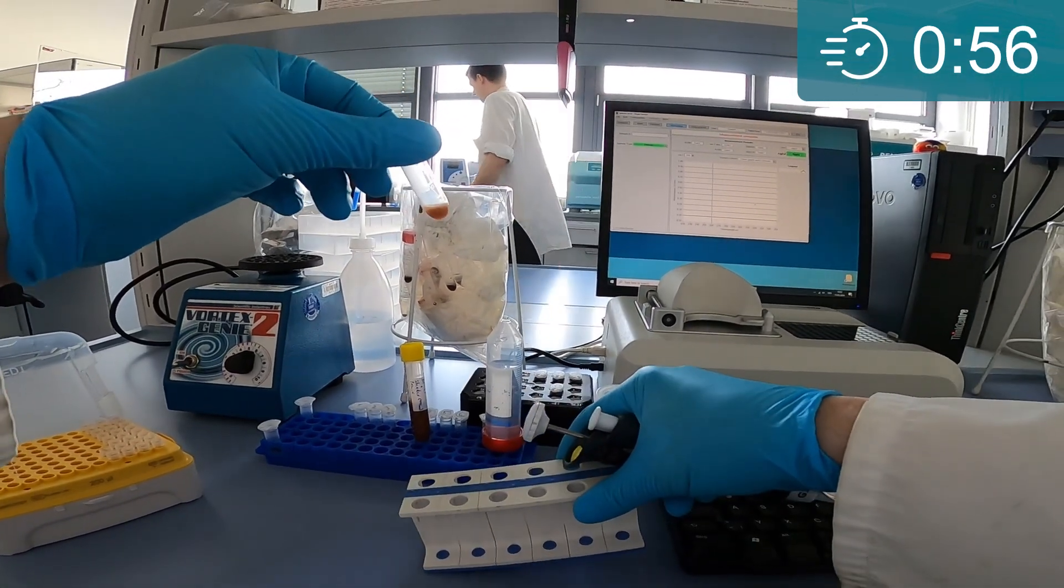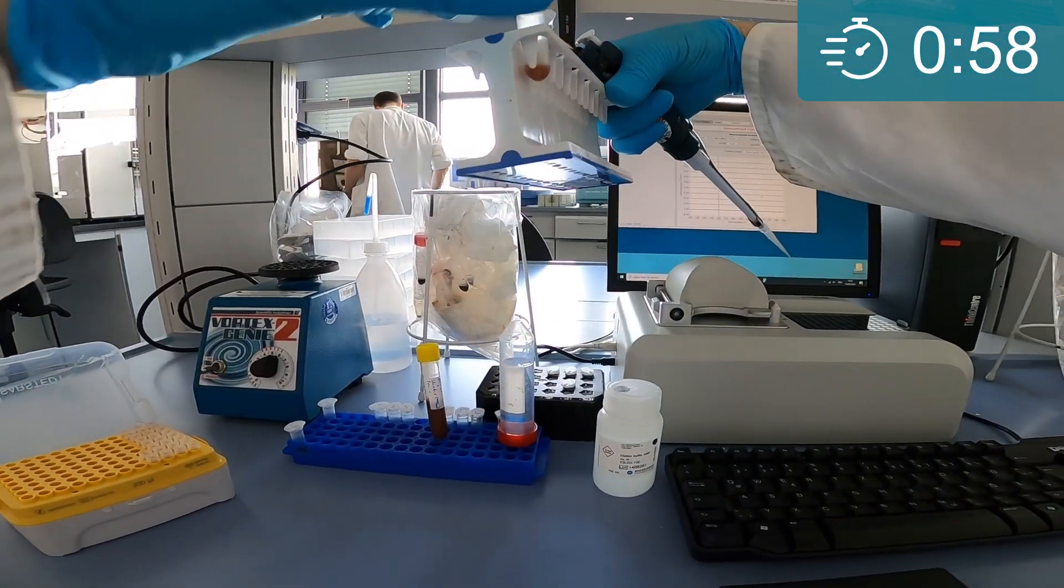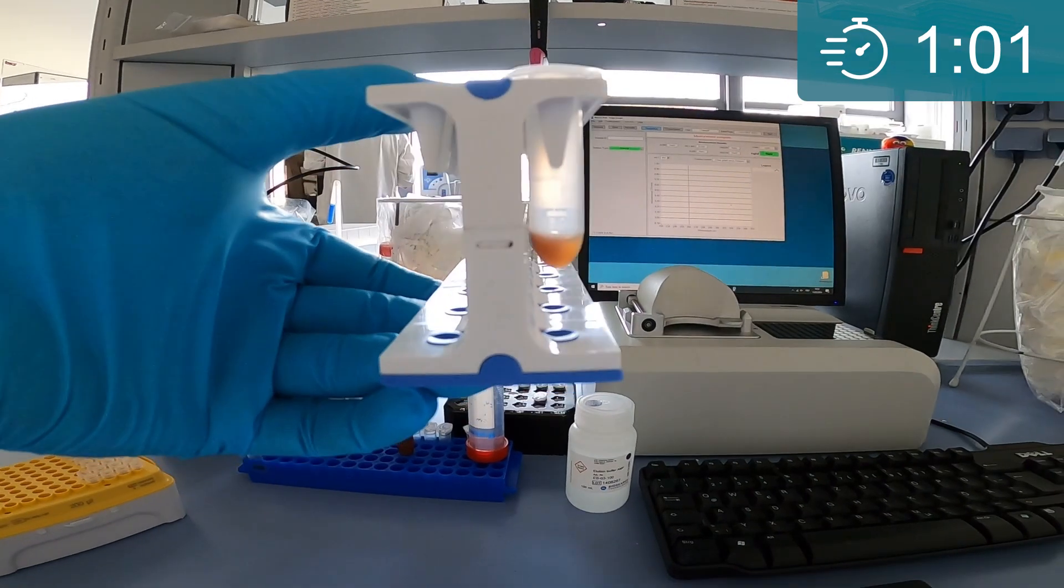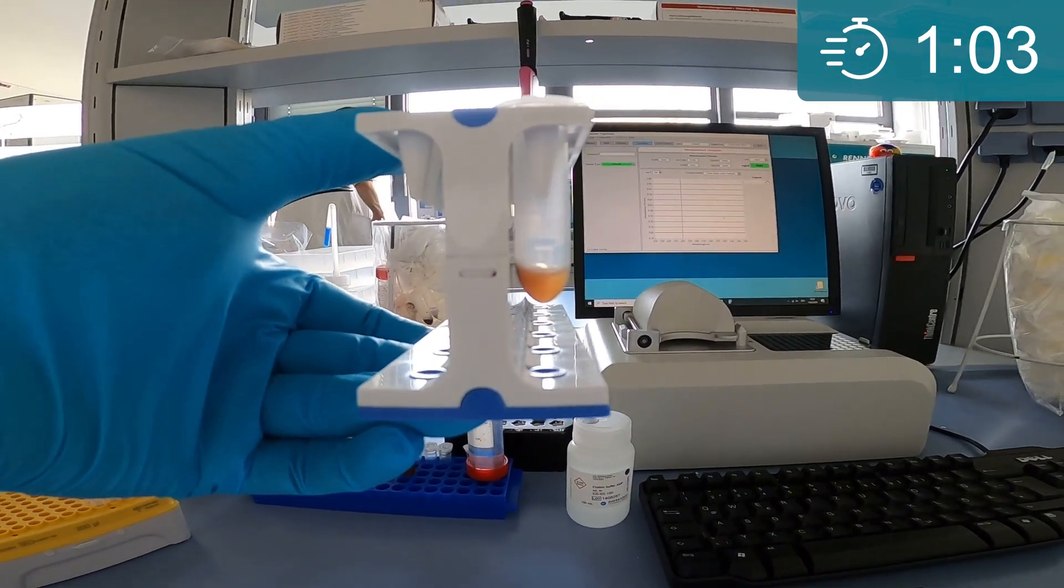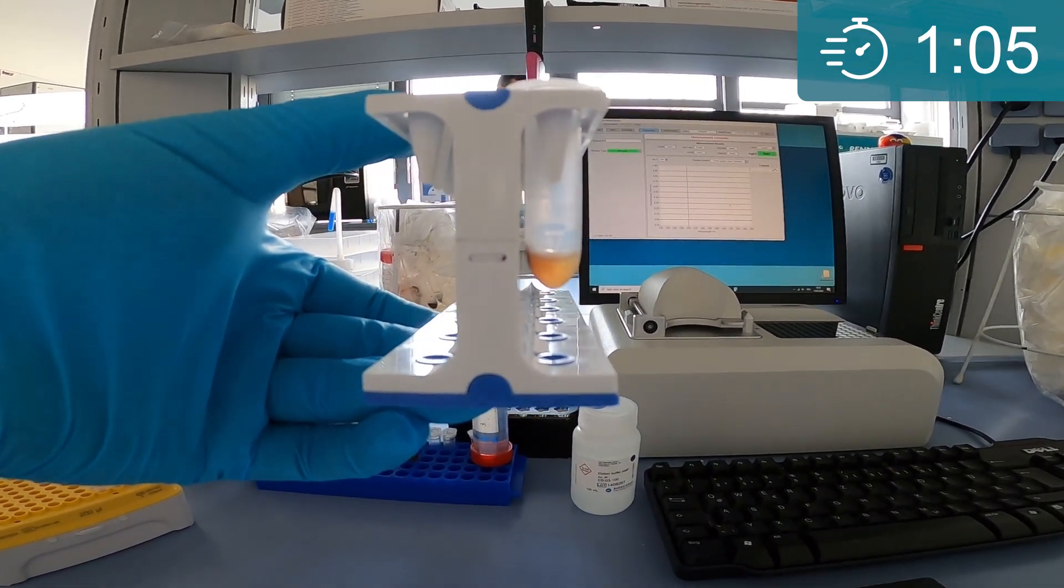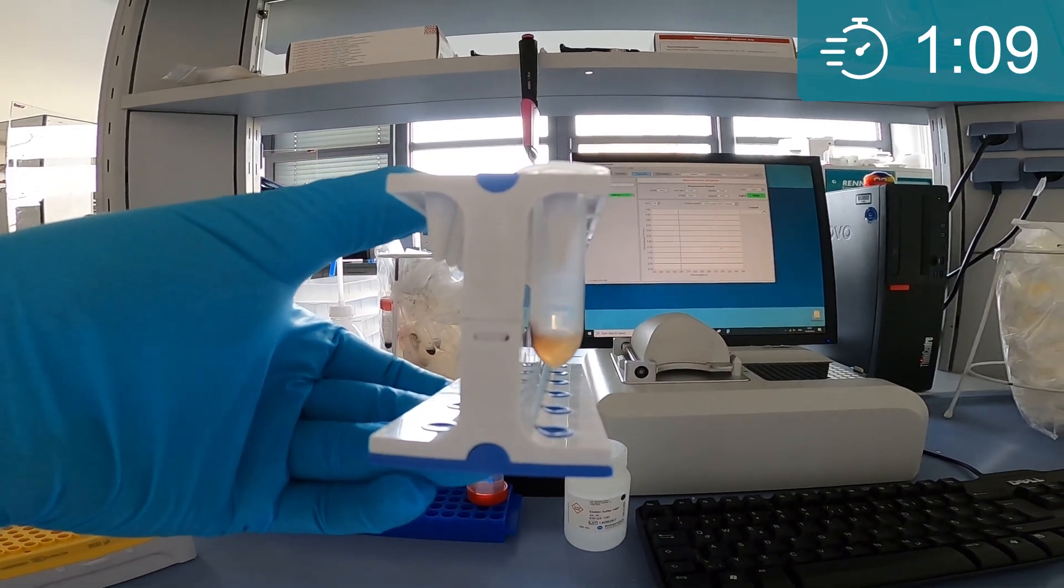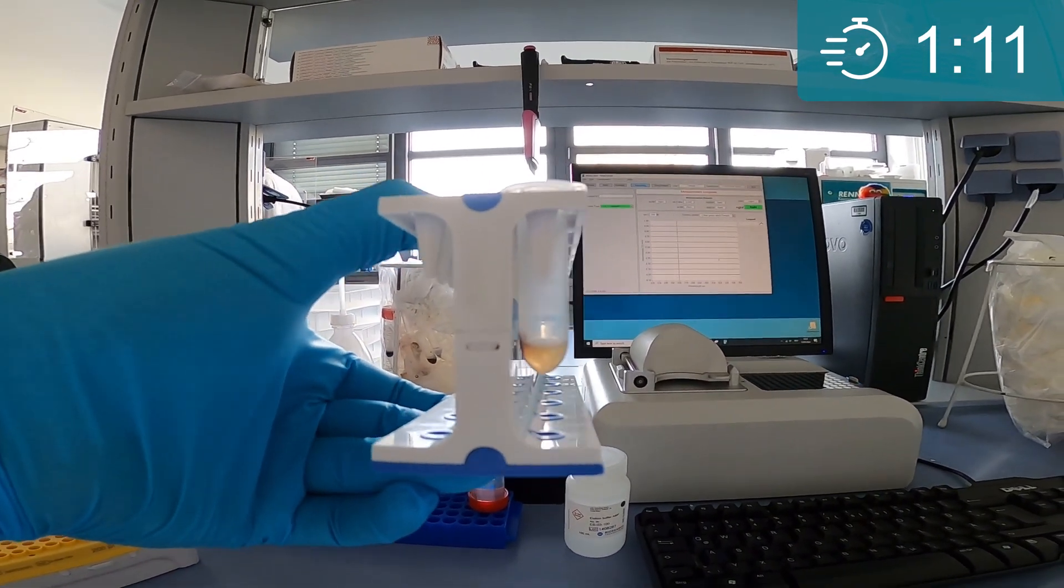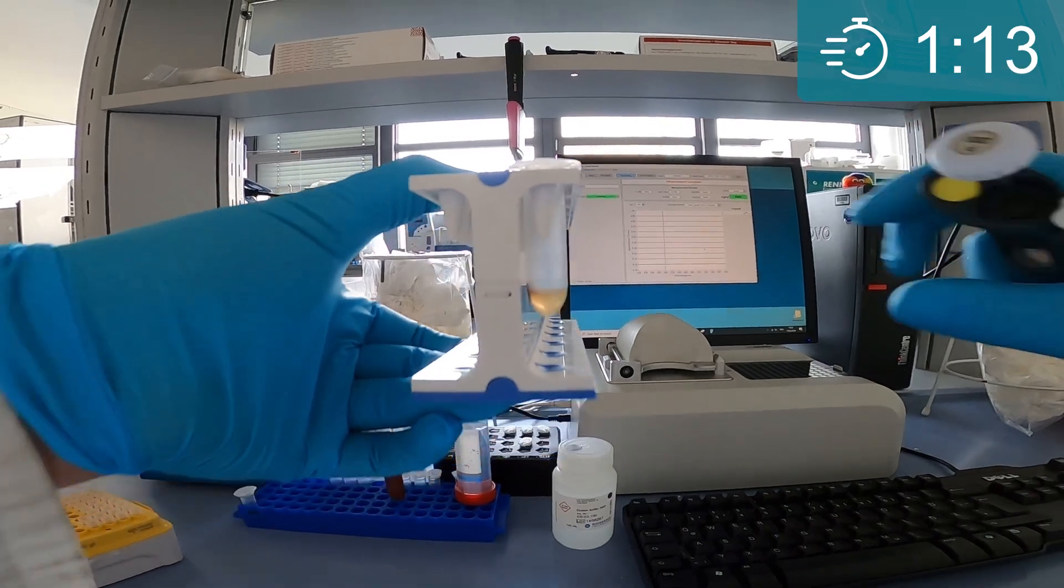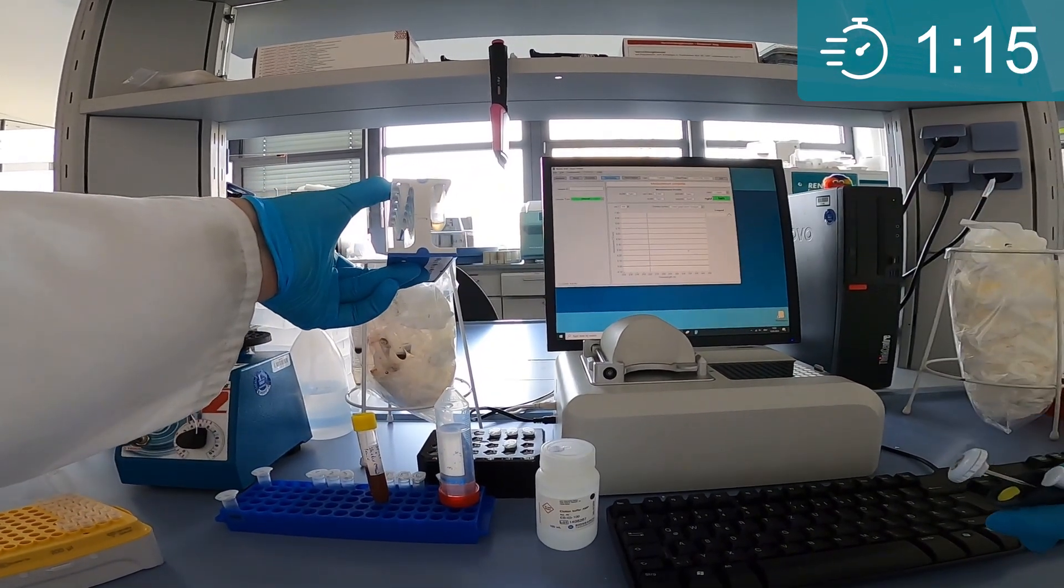To separate the DNA, you place the tube on a magnet until all the beads separate to the side of the well. The time it takes to separate the beads depends on the viscosity of your lysate, the lysate volume and the strength of your magnet. You can also use a centrifuge to spin down the beads.